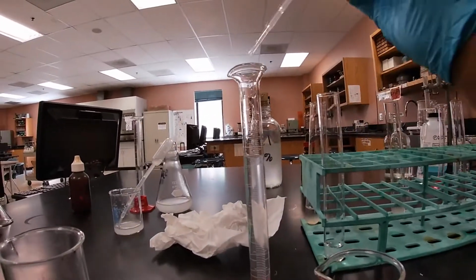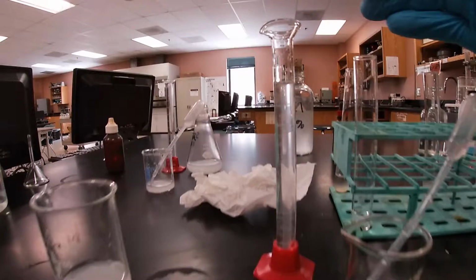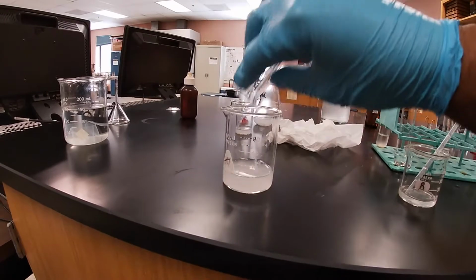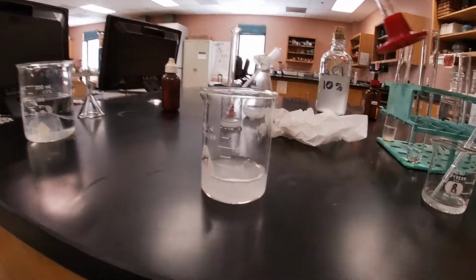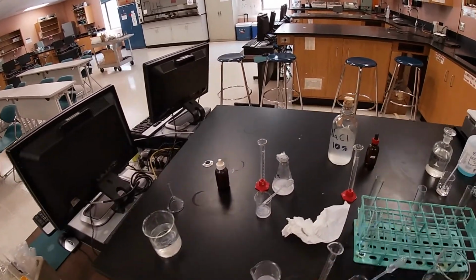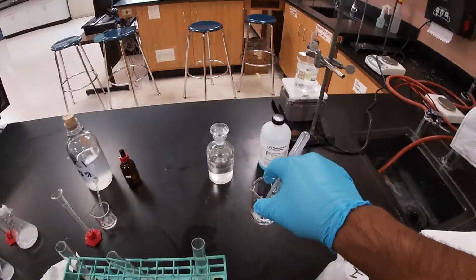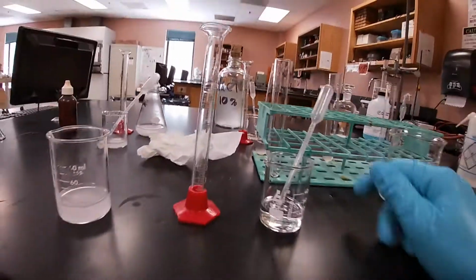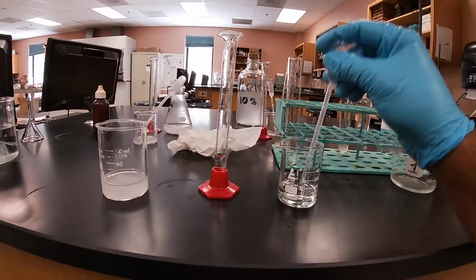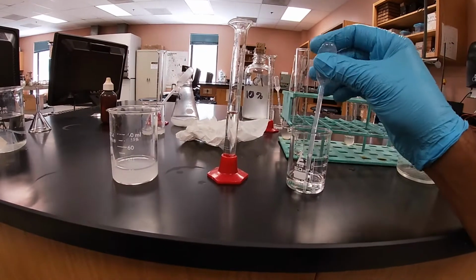Okay, so let's get closer. And our 10 milliliters of our sodium chloride solution, I'm going to go ahead and add them to our beaker. And then the last addition, we're going to measure out our glucose solution. And so we're going to go ahead and measure out 10 milliliters of our sugar solution.